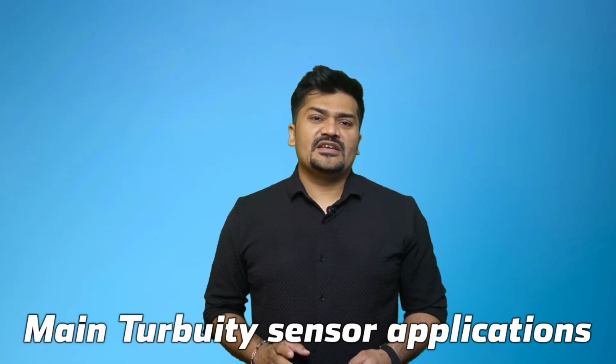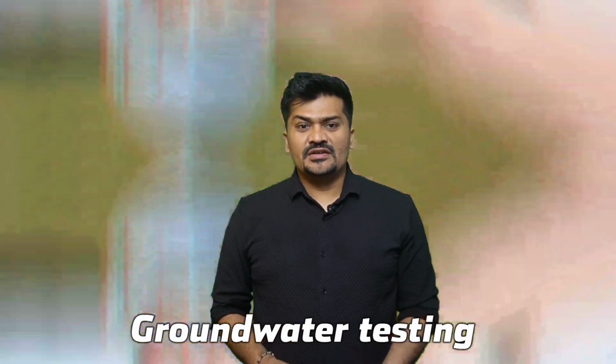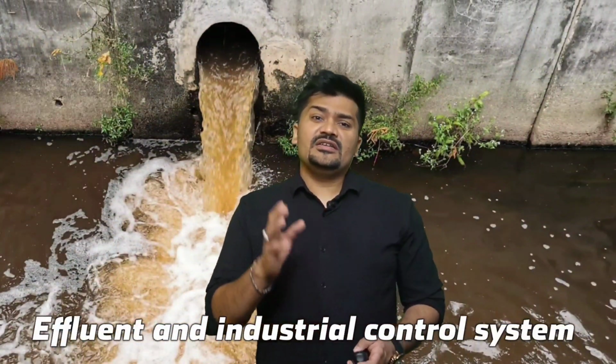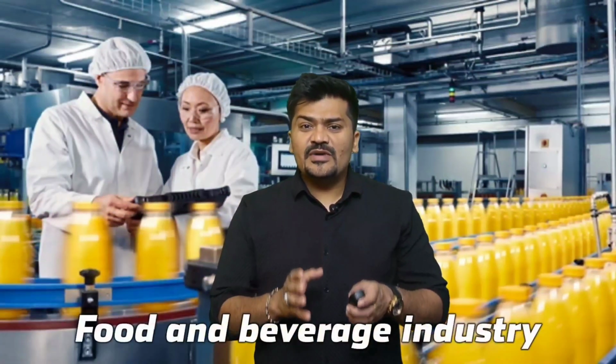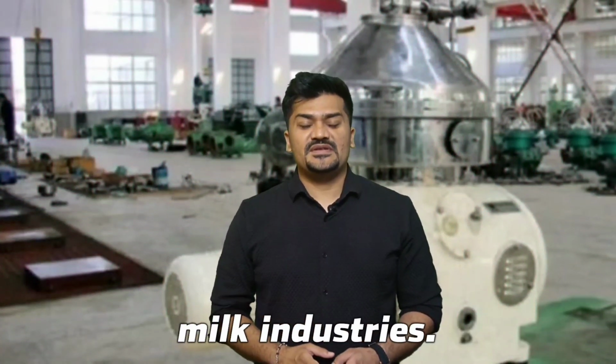Main turbidity sensor applications are water quality testing, groundwater testing, water and wastewater treatments, effluent and industrial control systems, leak detection of filters and gaskets, food and beverage industry. For example, yeast harvesting, and the phase separation in cream and milk industries.